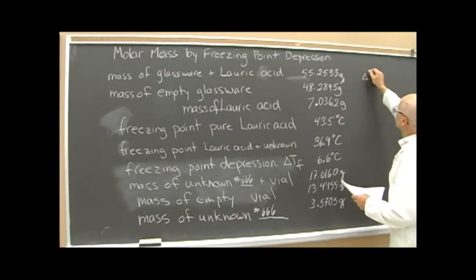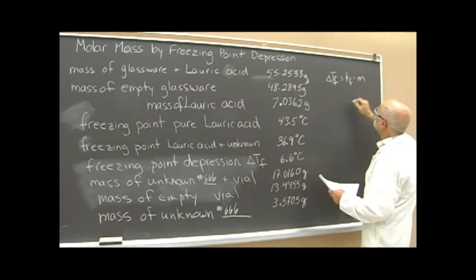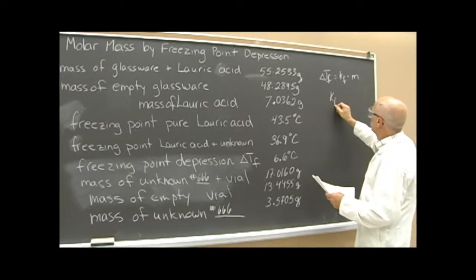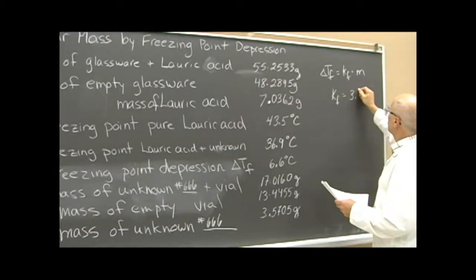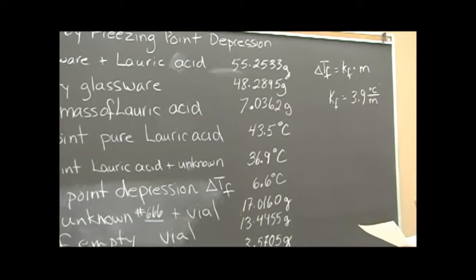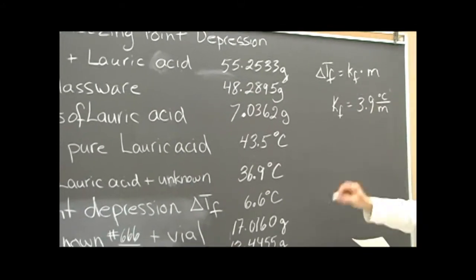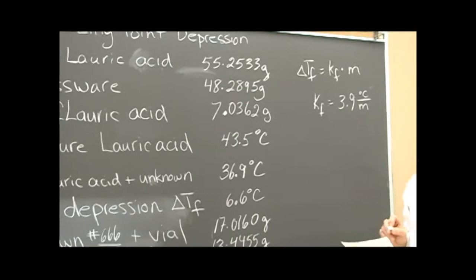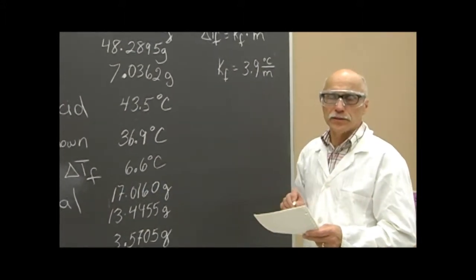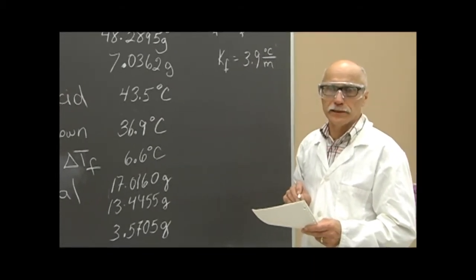And then you would rearrange the equation so that you can get the molar mass, Kf, out of the lab manual. So you'll be doing this calculation for molar mass after you obtain all your data, and you will be doing the calculation in class before you leave the lab, so that you'll leave with a correct and an accurate answer.